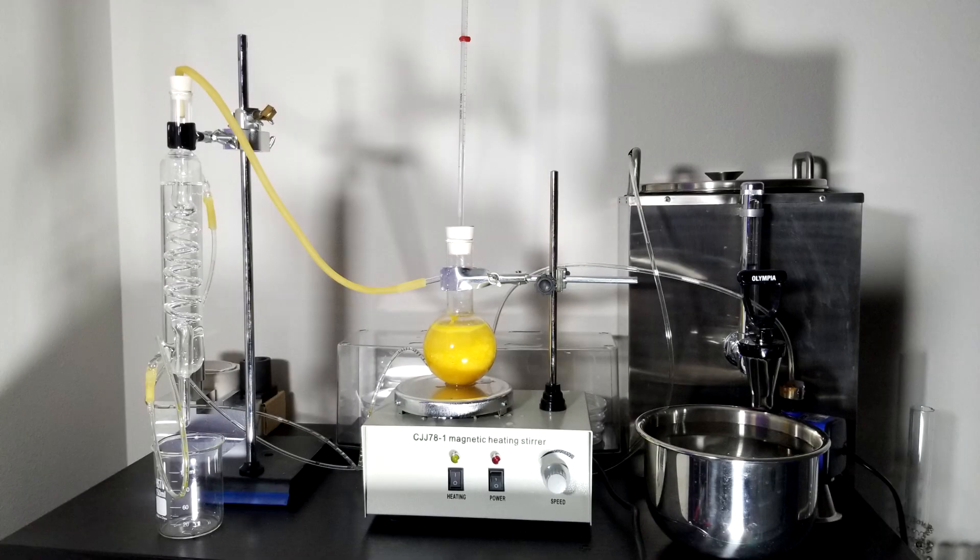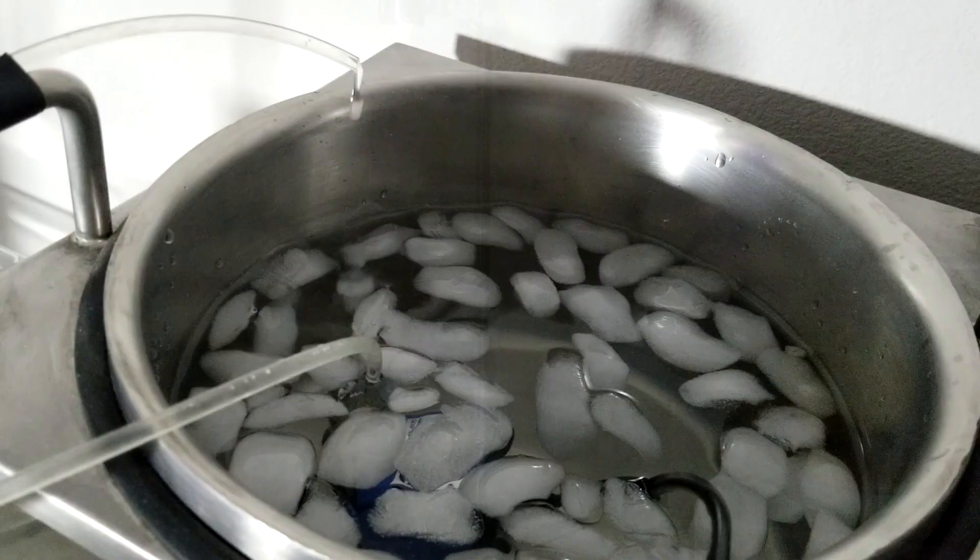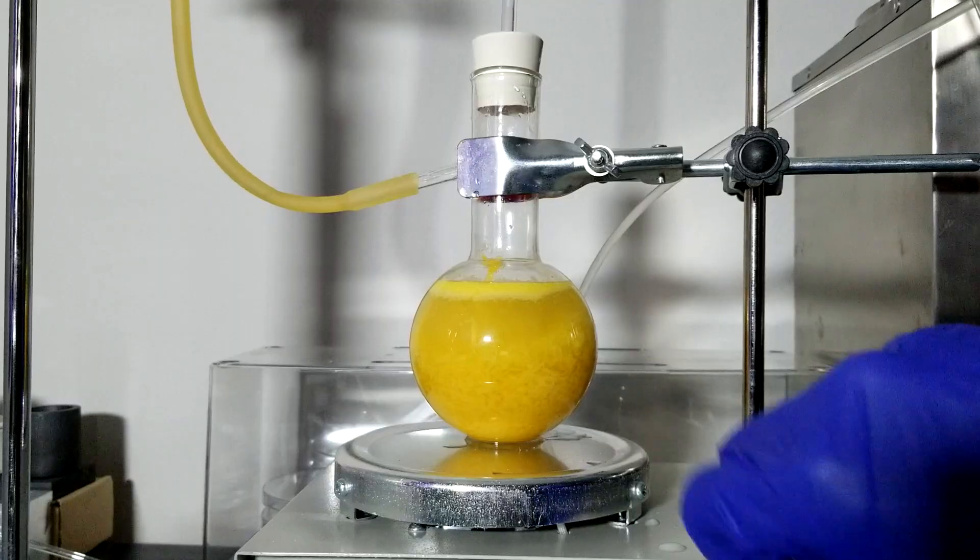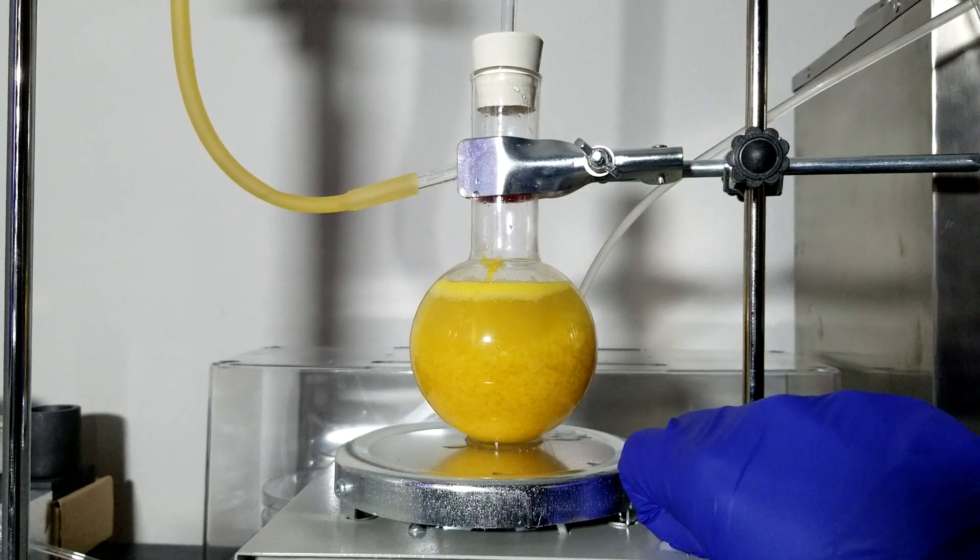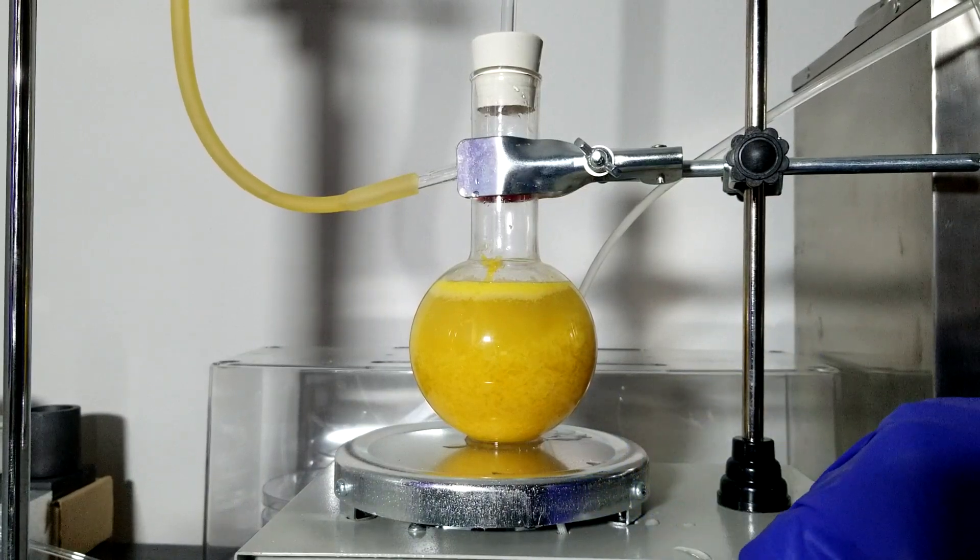Here is the overall setup now, and the condenser is now circulating with icy water. I turned on the heater and magnetic stirrer and started to heat them up past the boiling point of water to create steam.